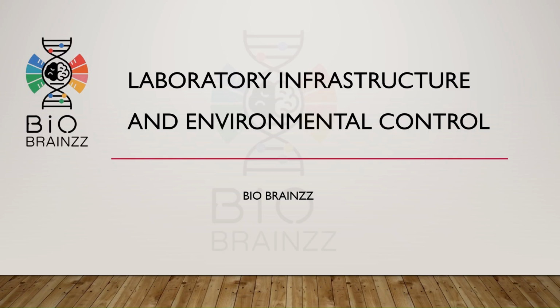Today we are going to discuss an important topic under good laboratory practices, which is laboratory infrastructure and environmental control. Many people focus only on experiments in laboratories, but the laboratory environment itself plays a crucial role in getting accurate and reliable results. So, in this session, we will understand how proper laboratory design and environmental control help maintain quality and safety.